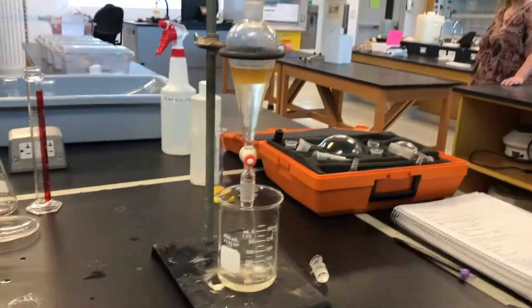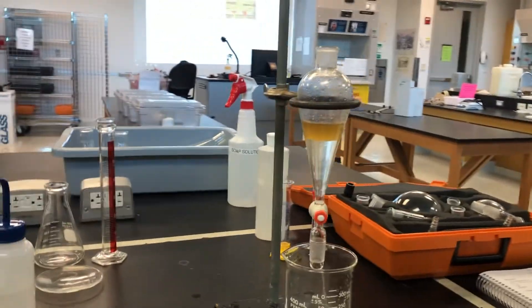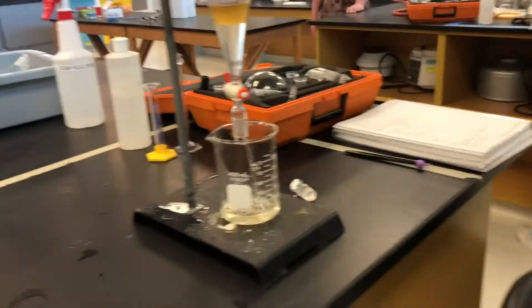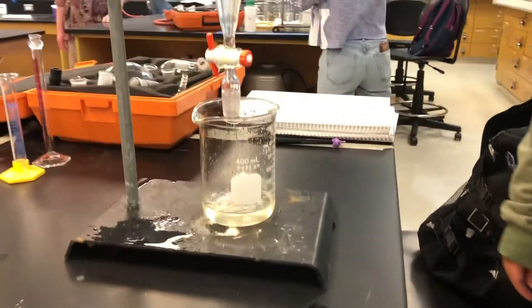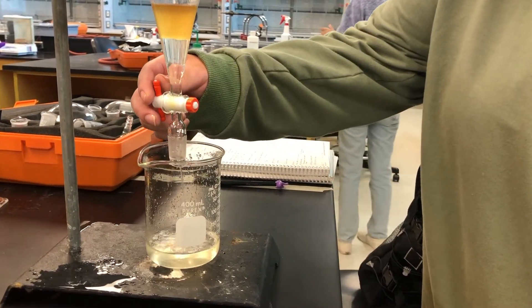Separate the aqueous layer and the organic layer. The aqueous layer can go into the sink and the organic layer stays in the separatory funnel. If you're unsure which layer is which, add distilled water and you'll see the aqueous layer expand.